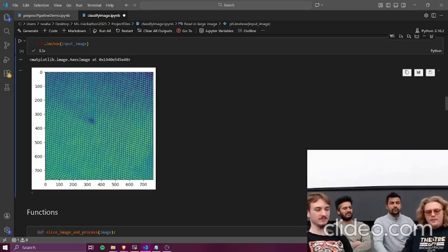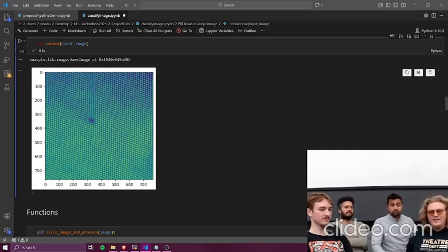Hello, we are Okstate01, and we decided to tackle the identification of atomic resolution defects in STEM images. A study this year, published from the Russian Academy of Science, found that less than 2% of all TEM images are actually published, and part of that is due to the overhead cost of the time that we have to spend manually masking everything and processing it. So we decided to attempt to do that with a convolutional neural network.